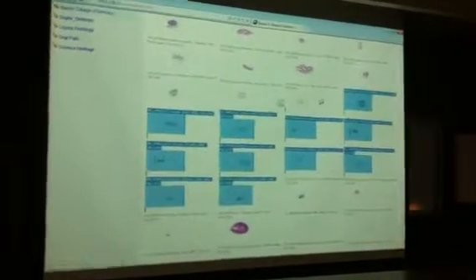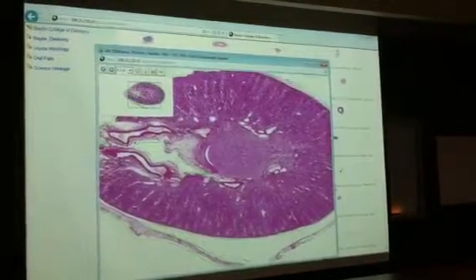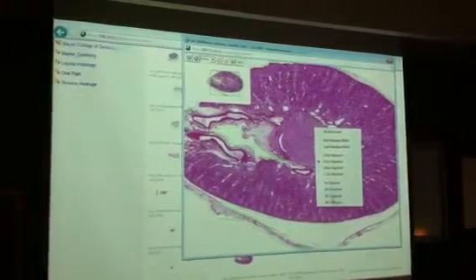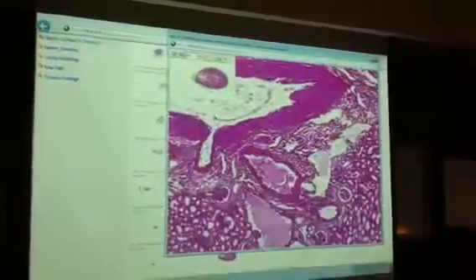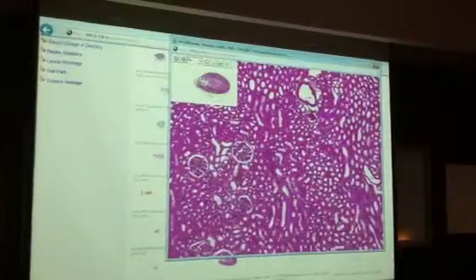Now, also, one other place where you can see it identified as a brush border. Well, we need to say simple columnar with the brush border. No. Nice. I understand why you'd say that. No. When we were looking at these tubules, here, up here. Sorry, gotta move this a little bit. Those are different. Okay, so when we were looking at here, that simple columnar, simple.